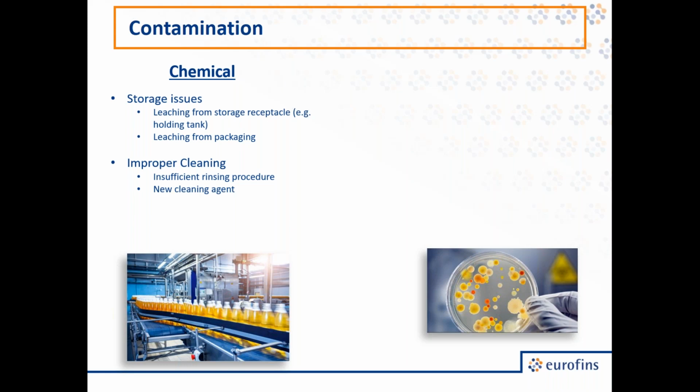Something else that is very common is contamination with cleaning agents, where a production line or a packaging facility was washed with a cleaning agent and that wasn't thoroughly rinsed out of the system. In that case, you can get contamination in your product, which often leads to solvent or chemical-like off odors and off flavors, or sometimes acidic off flavors if the cleaner was acidic.